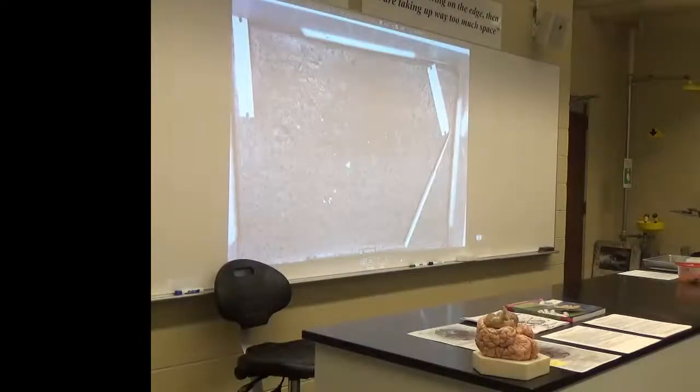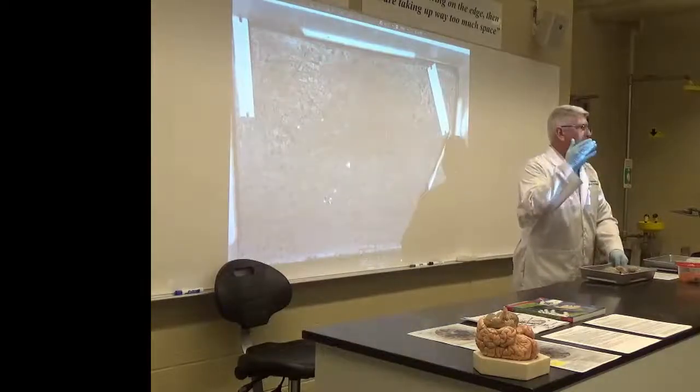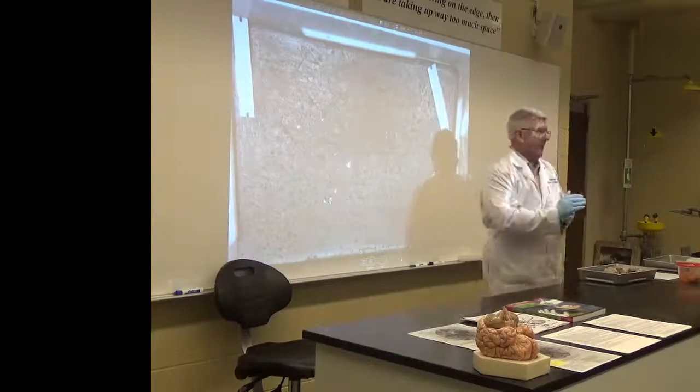Who can tell me what a coronal cut looks like? What's the view that we're looking at? Right through the lateral thing. Yes, so it's like you're looking straight into the brain, like face on. So we're doing cuts that are perpendicular to the floor, right? So we're slicing this way through the brain, from the top to the bottom, right?